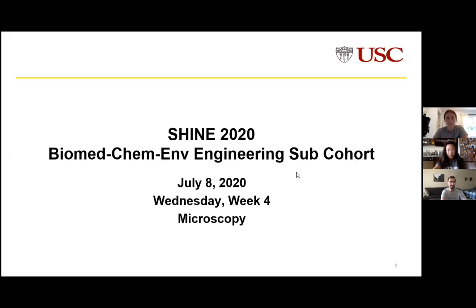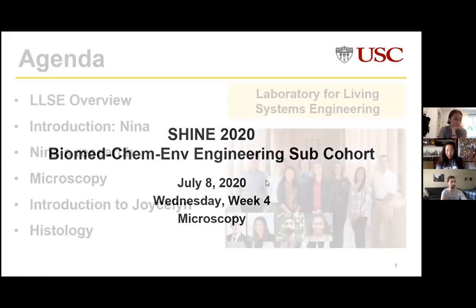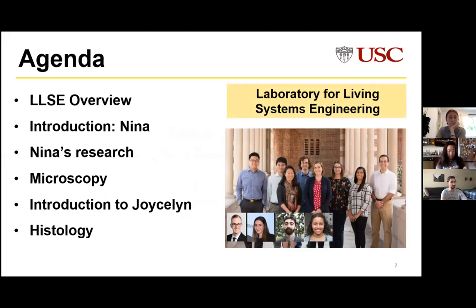My name is Nina, and Joycelyn will also be presenting, and we're from the McCain Lab. So today we'll be talking about microscopy and histology, and we'll go ahead and start with microscopy. We'll start with an overview of our lab, my introduction, an introduction of my research, and then the microscopy, and then I'll pass it over to Joycelyn.